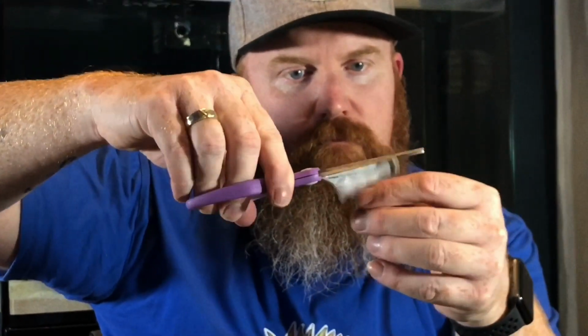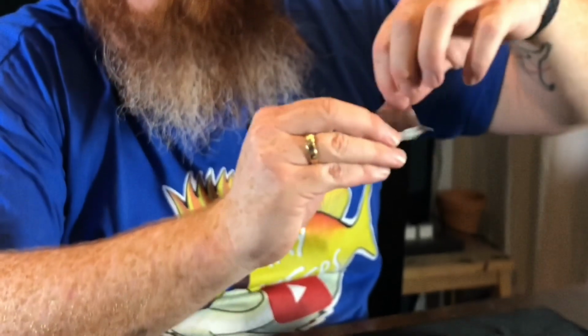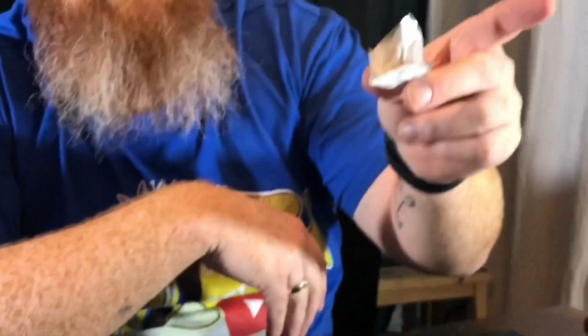Now these little satchels are really difficult if you don't know what you're doing. It was Inappropriate Reefer that did a video that actually showed you. The best thing to do is fold them in half, like that. Grab your scissors. Cut that bit off. Open it back up again. Not all the way. It creates a nice little funnel.